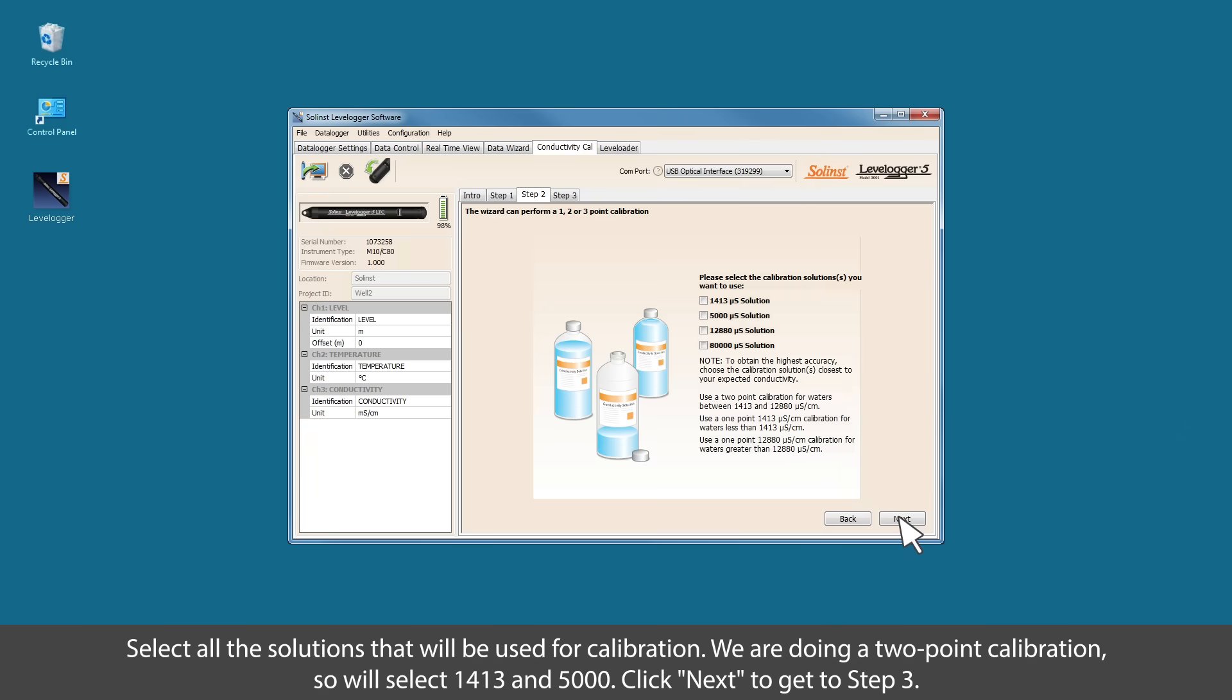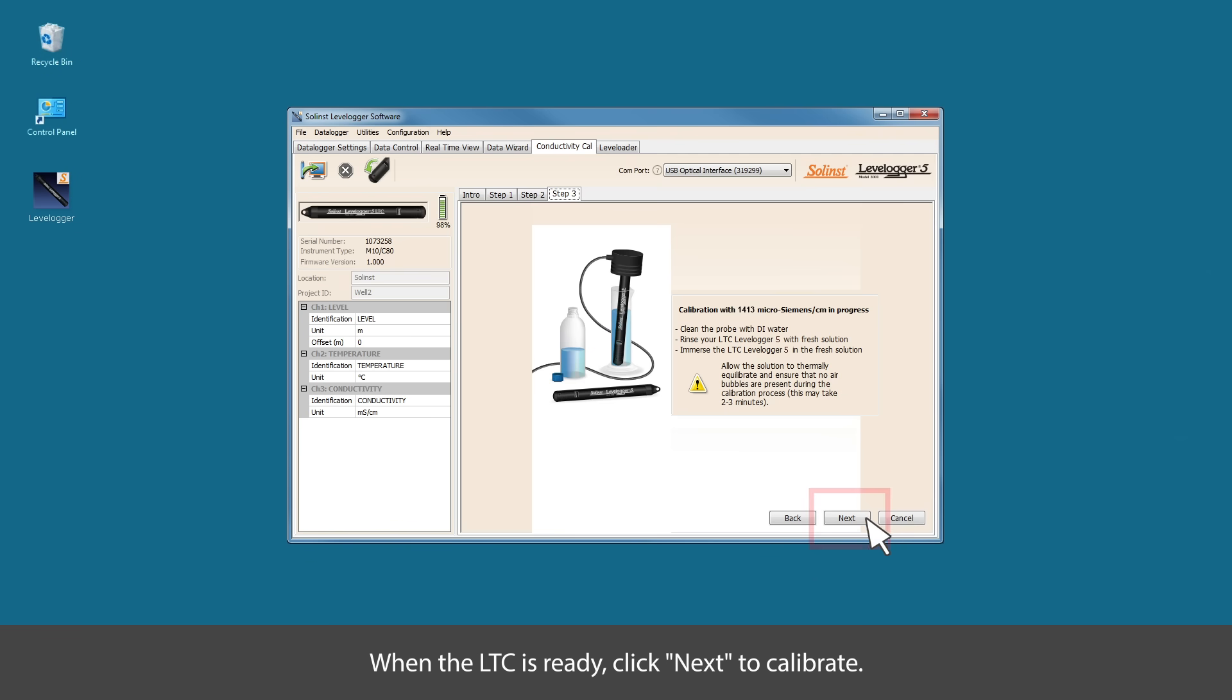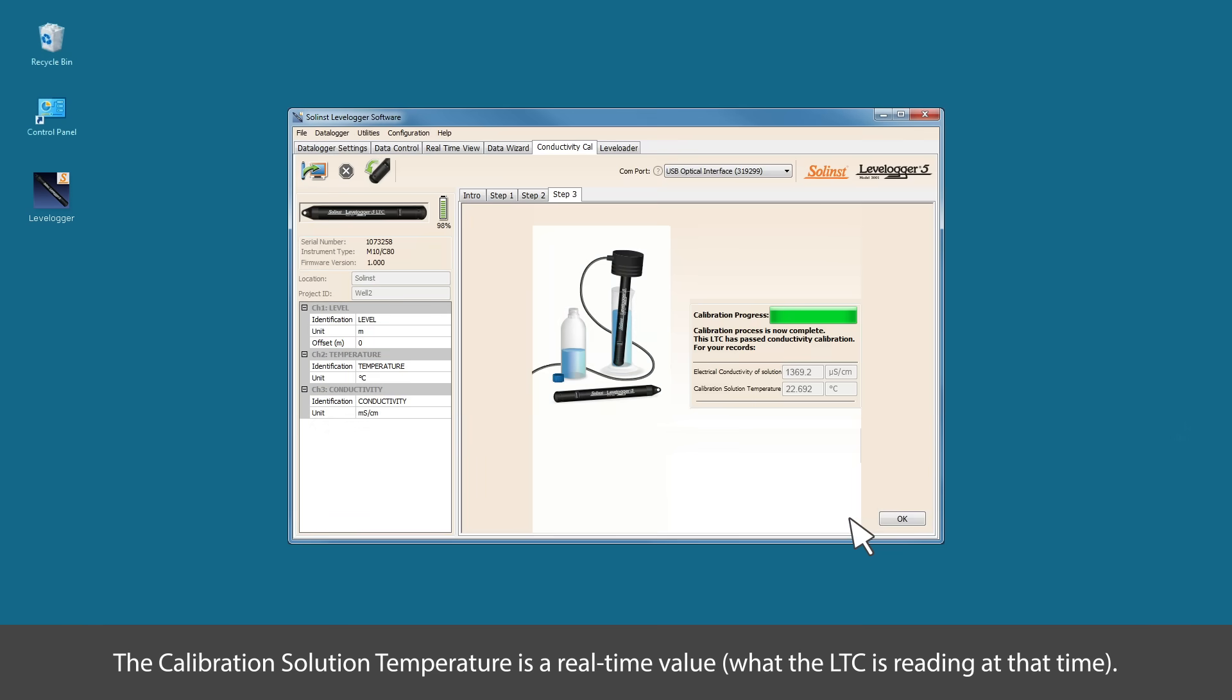Select all the solutions that you'll use for this calibration. We're doing a two-point calibration, so we've selected 1413 and 5000 microsiemens. Be sure that you've cleaned, rinsed, and immersed the probe as previously described. You can use real-time view to verify that the temperature readings have stabilized. When the LTC is ready, click next to calibrate.